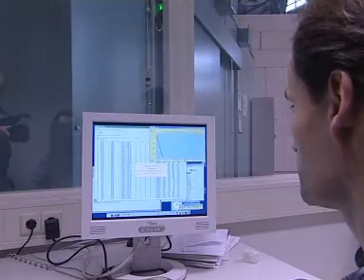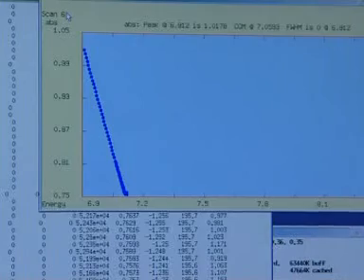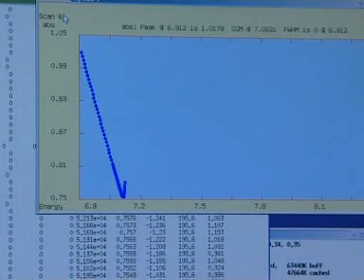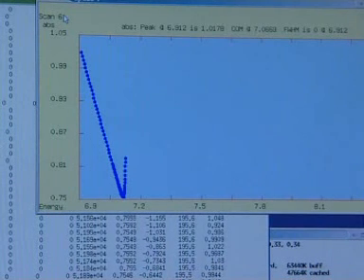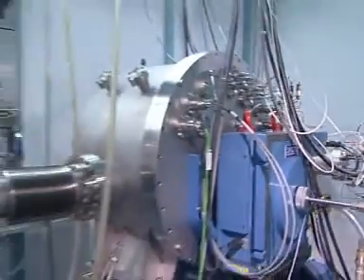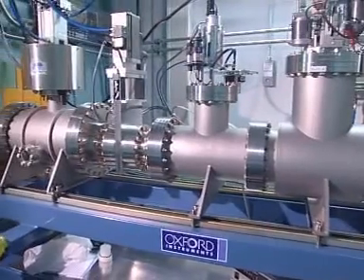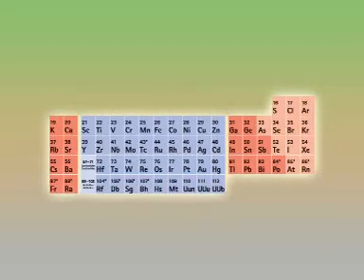A measurement consists of several hundreds of data points, each of them with a slightly different wavelength, and contains the absorption edge, including the fine structure near it, for the respective element to be examined. This method can be used efficiently only with synchrotron radiation sources, as the X-ray source must have a white, very intense spectrum. XAS allows all elements to be examined from sulfur to heavy uranium.